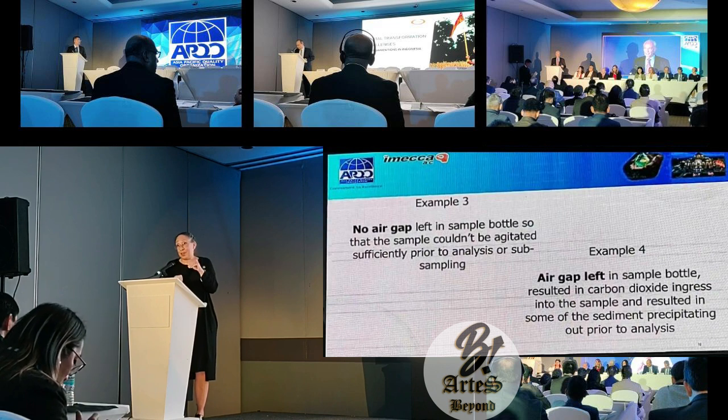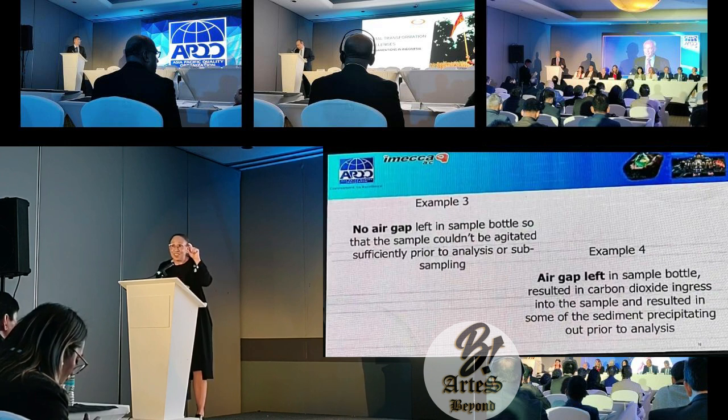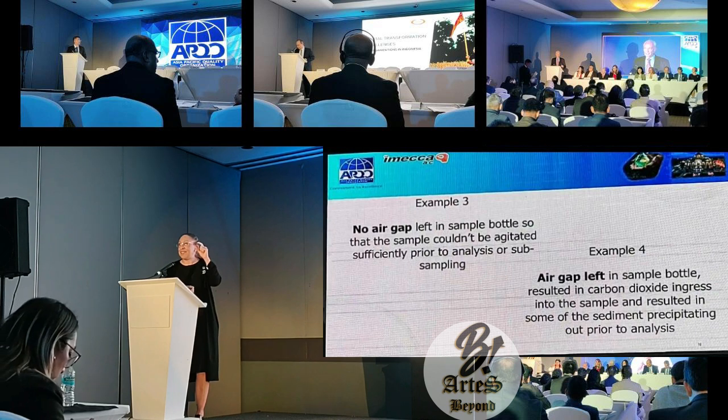Another laboratory I worked with was testing for total dissolved solids. That's a critical point in water quality, total dissolved solids. He presented it with a gap. But for that test, if you have a gap, you have carbon dioxide in that water, and in the air will go into the water and change the solubility of your sediment, and your sediment will start to drop out in the sample because you left an air gap at the top. So the sample being tested didn't represent the sample that was taken because the air had affected it.